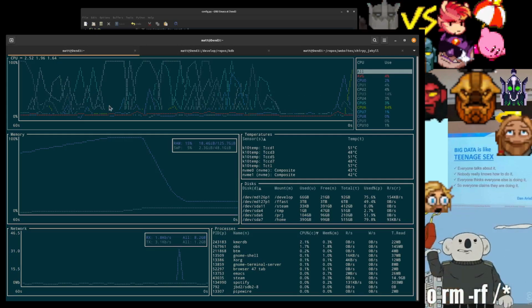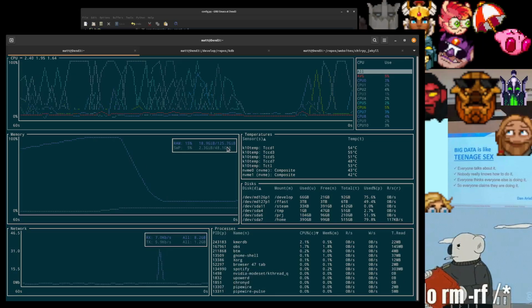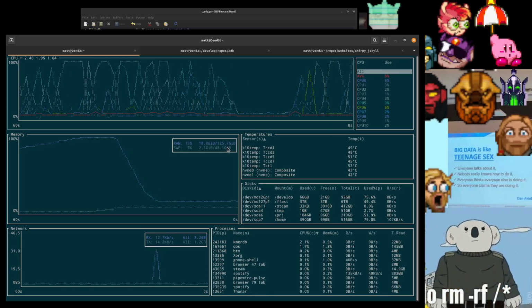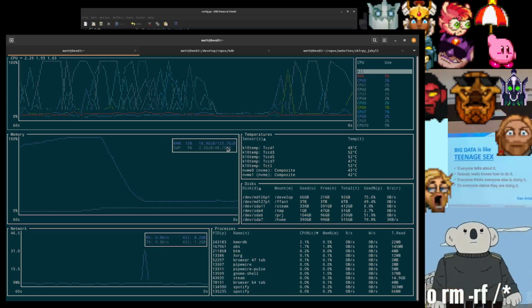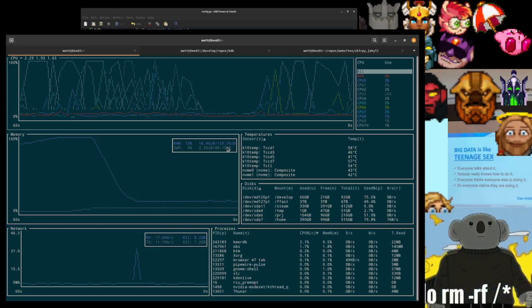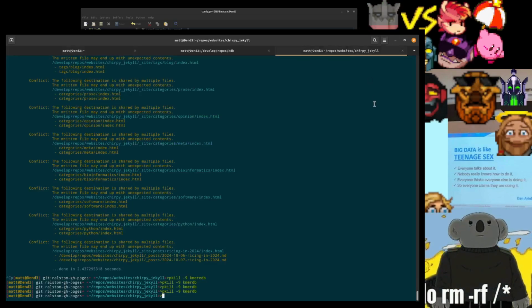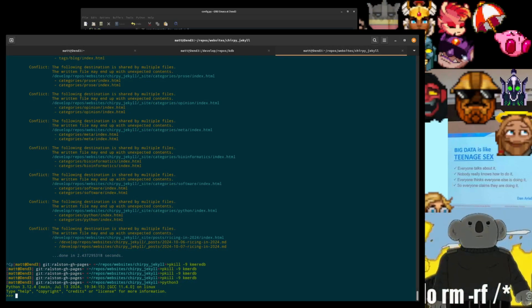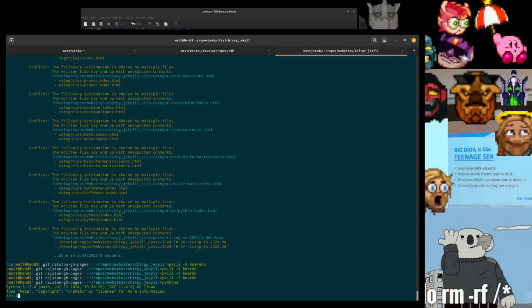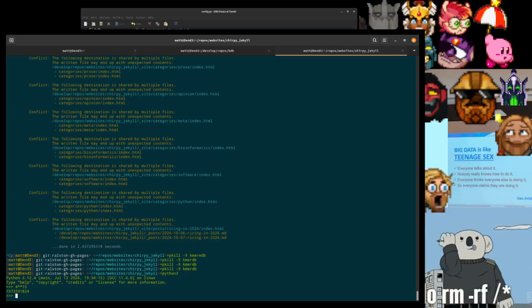So the reason I'm showing this is I've got 125 gigs of memory on my machine. Part of the point is that the memory usage of a simple k-mer counter can become very large because you're storing, how many? I don't know. Let's find out. How many k-mer IDs, numbers are you storing? 4 to the 15th.